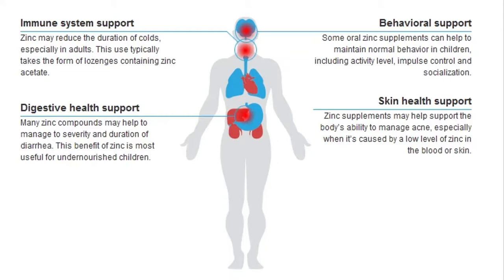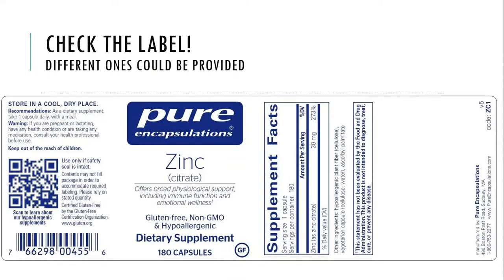All right? All right, so when you get the pill bottle, this might be one of your brands. It might not be. But what I need you to look for when you get this pill bottle is, number one, serving size. Make sure this says one capsule. If it says two capsules, then the servings per container will give you an amount that is not per one capsule.